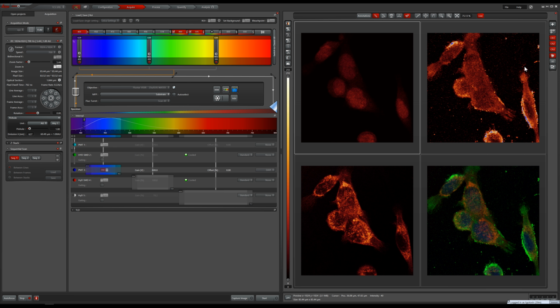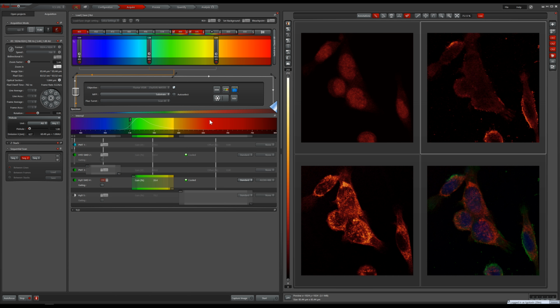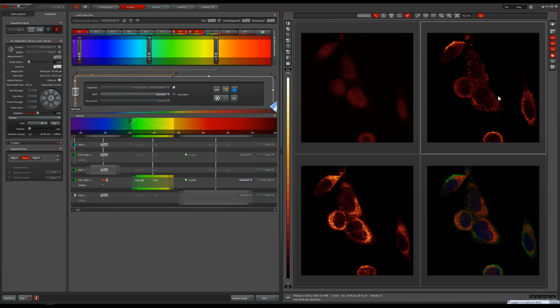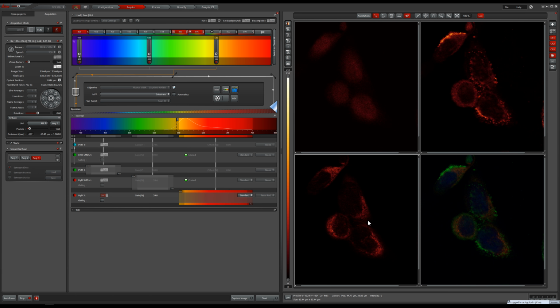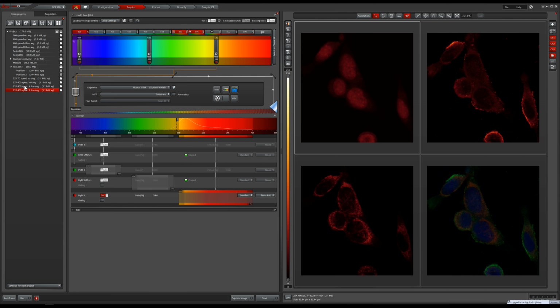Technically, you could start with your desired objective lens right away, but especially in the beginning using a lower magnification can help getting a solid overview. When we compare the same settings we explored in the 10x, now with the 25x, the bump in NA going from 10x to 25x visibly improved the resolution.